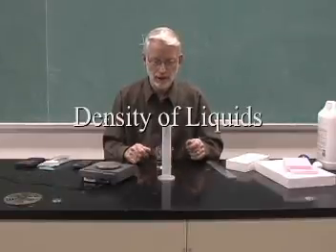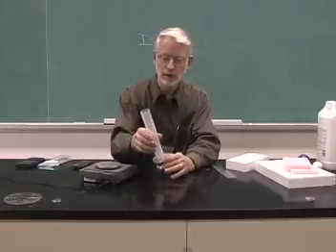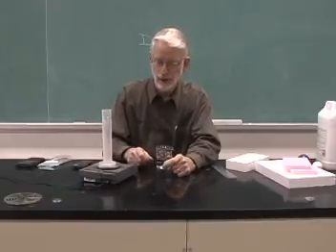Let's begin by determining the density of water. I have here a 100 ml graduated cylinder. We can determine its mass using a digital balance.